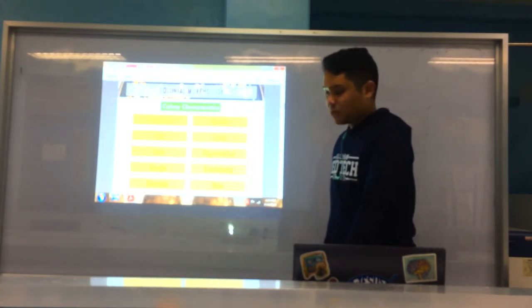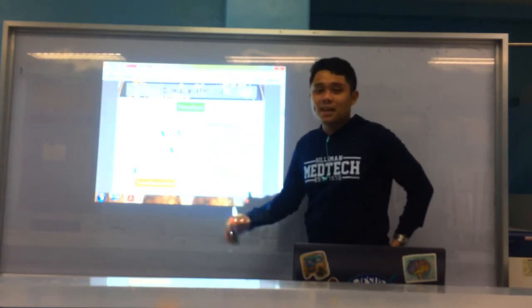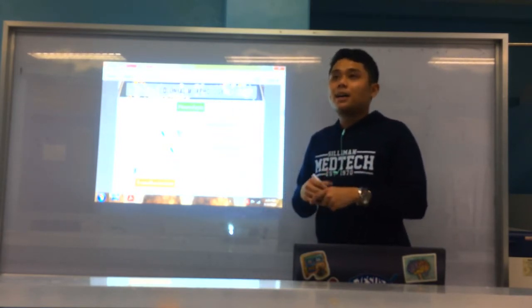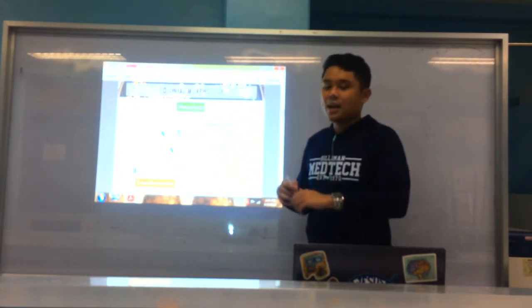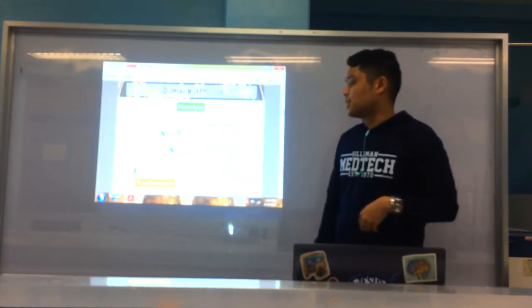All right? Okay, so we'll start first with the hemolysis. Of course, your hemolysis, it was already mentioned in differential media, we observe hemolysis on the blood agar plate. We have complete hemolysis, a clearing of the media around the colonies. So you have beta or complete hemolysis. You have your alpha hemolysis, a greenish discoloration of the media. And no hemolysis is gamma hemolysis.